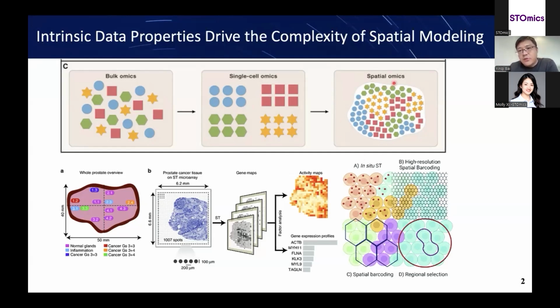However, for the spatial transcriptomics, we aim to analyze a target cell, while the neighboring cells, how these cells communicate with each other is a research hotspot in this field. So it is not for populational analysis.